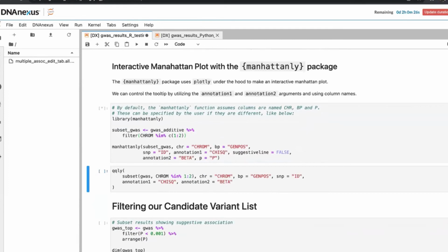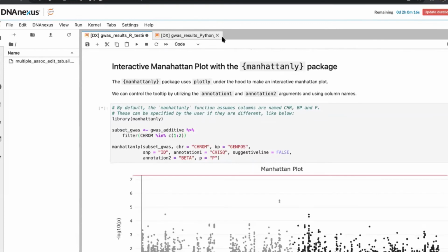Okay, so while we're waiting for this to generate, I'm just looking at Q&A. So can scripts be modified offline prior to starting an analysis? The short answer, Kiara, is you can modify scripts using your own local JupyterLab instance, for example, and then you can upload it onto RAP if that's what you want.